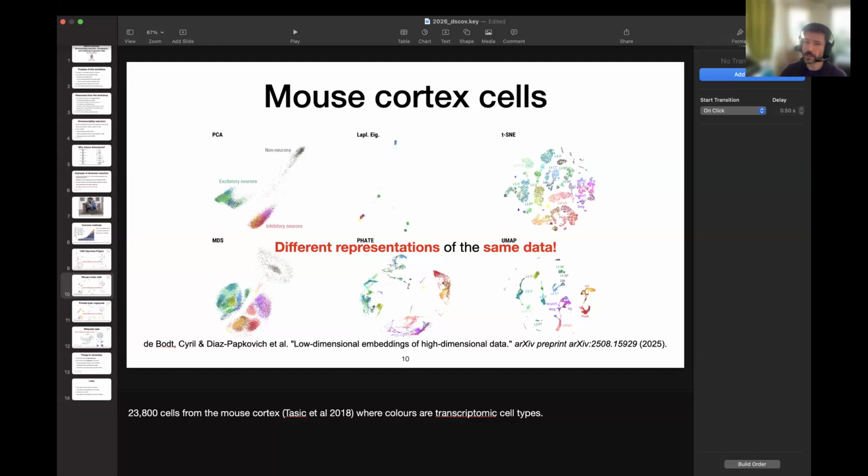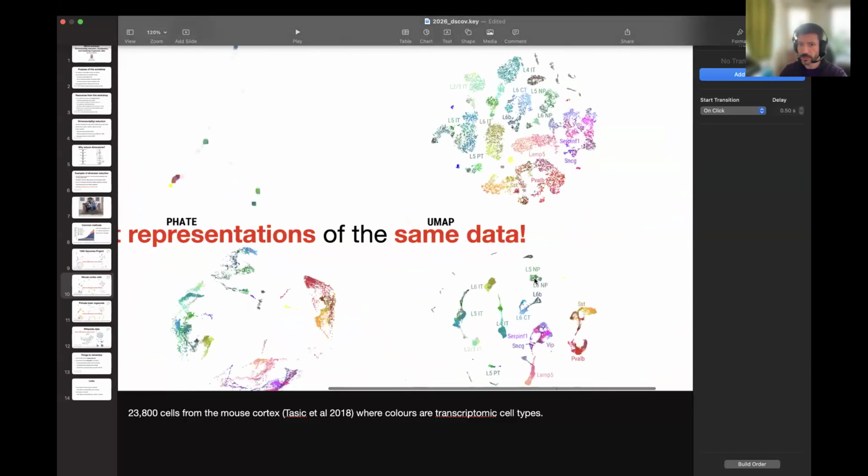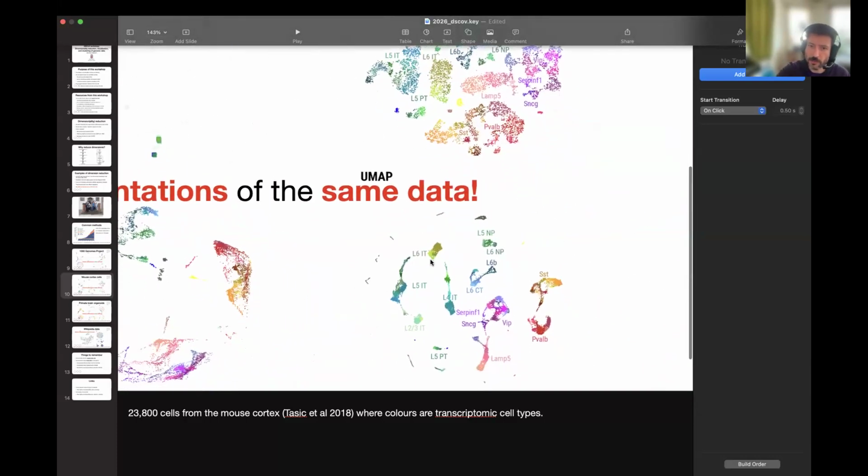And it can also have a little bit more continuity than TSNE, which is to say that some people would say it preserves global structure better. I don't know if that's the right way to put it, but the idea is, if you zoom in on TSNE and UMAP, you can see that UMAP does stretch out these tendrils that kind of connect between the different cell types. So the local distances, if you'll recall, are a bit interpretable, but the long distance ones are not.